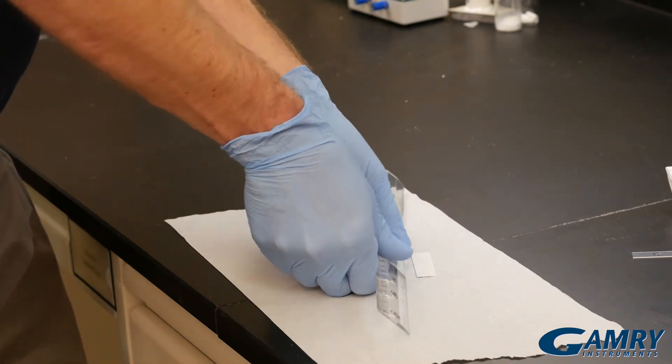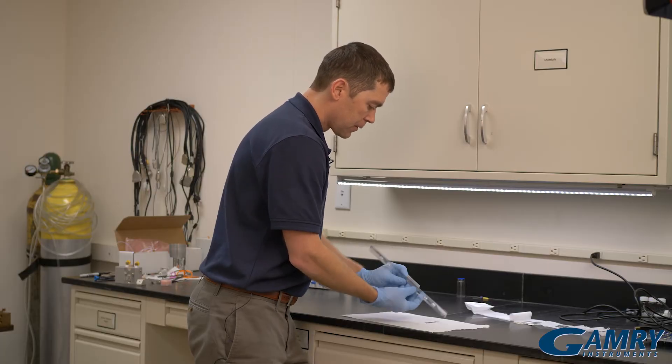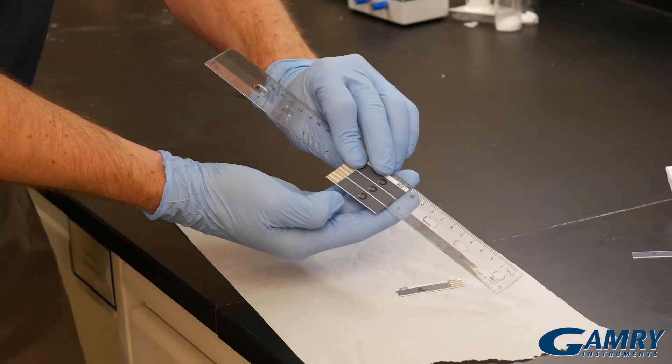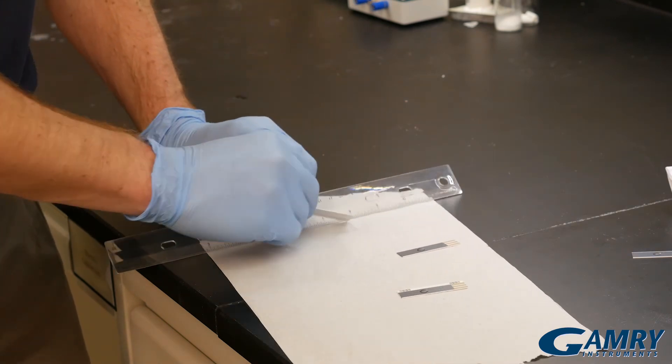Then I simply press down and I've snapped one off. I'll show again: I line the ruler up with the white scribe line in between the screen printed electrodes, push down, and I've snapped off another screen printed electrode.